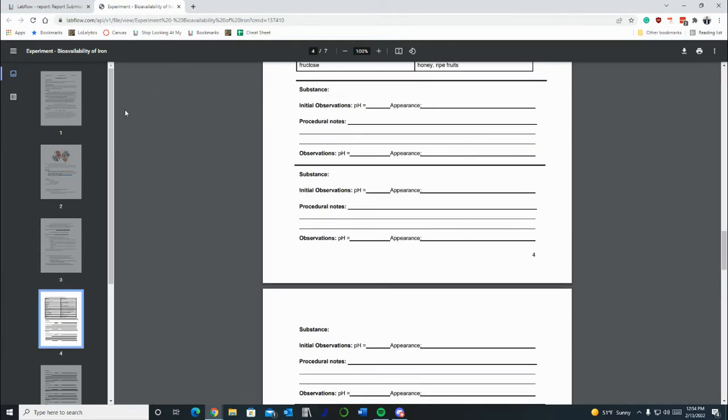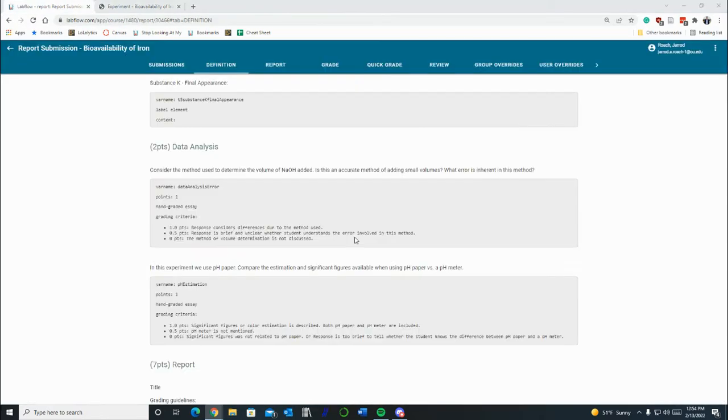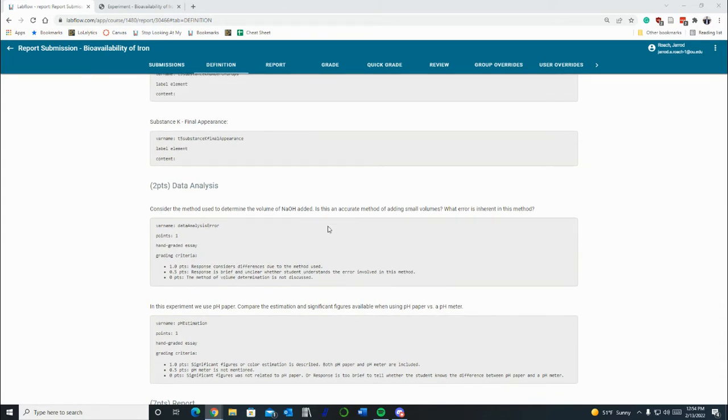So let's talk about your report a little bit. I'm going to pause real quick. Your report this week, you're going to have 2 questions, and then you're going to write your 7-section report. Your first question is asking you to consider the method you use to determine the volume of your sodium hydroxide added, and whether that is an accurate method of adding small volumes. The way you're going to be adding sodium hydroxide is using a dropper. So what this is asking is, is a dropper going to be consistent in the amount of liquid it gives? Is the drop size going to be the same every single time?